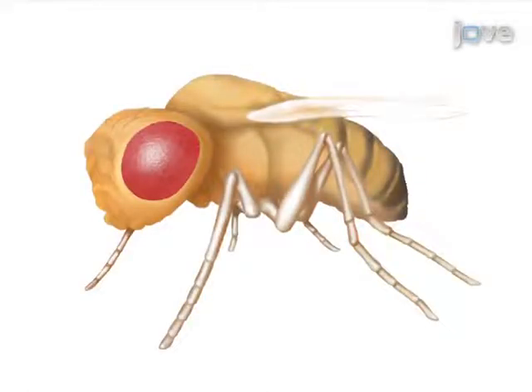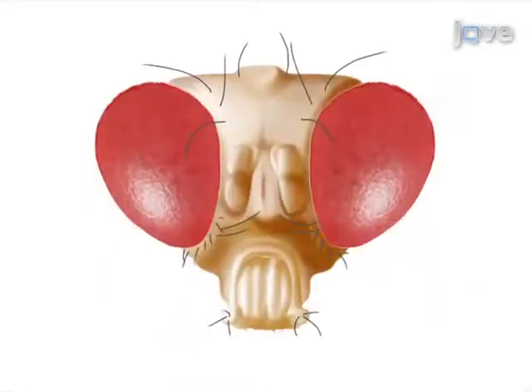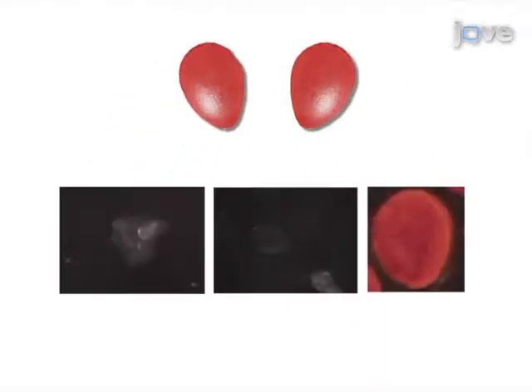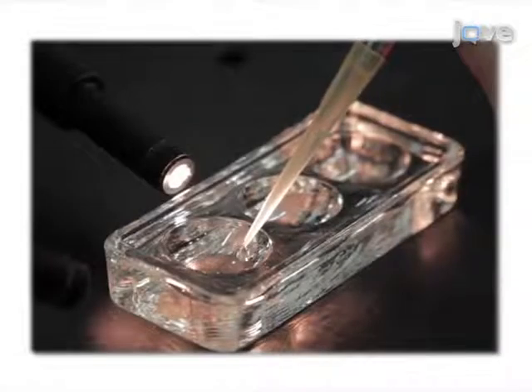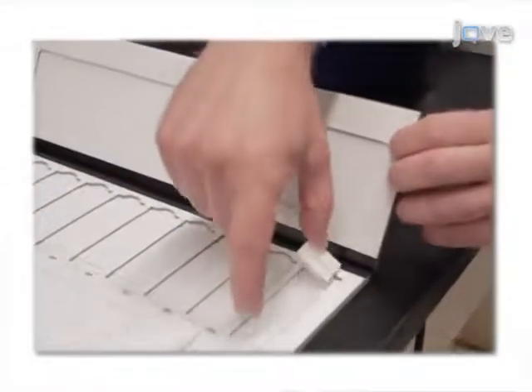First, retina dissections are demonstrated at three developmental stages: the larval stage, the pupal stage, and the adult stage. The next steps are fixation and immunohistochemistry. In the final step, the retinas are mounted onto slides for visualization using confocal microscopy.